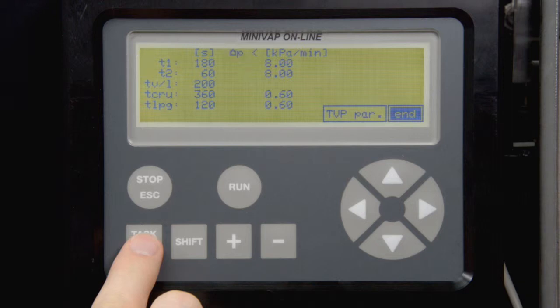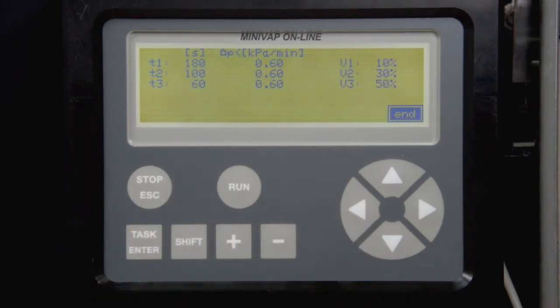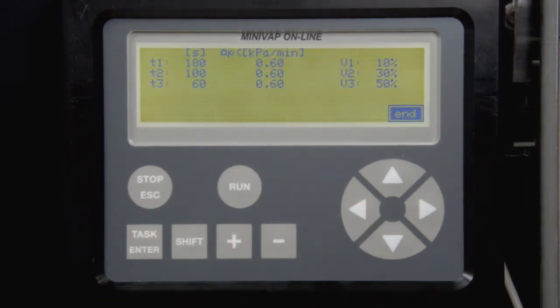To change the settings for TVP measurement, go to TVP Par and press Task. Here, equilibrium times and measuring points for TVP measurement can be adjusted. The TVP measurement will test three different V over L and extrapolate to a V over L ratio of zero. This method has been verified on a huge sample set of crude oils.